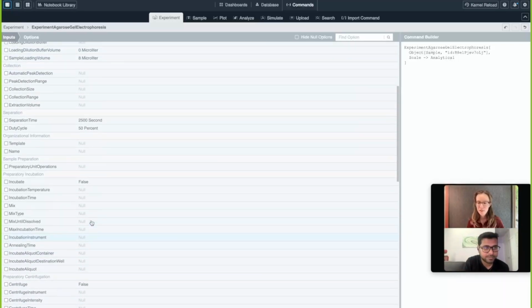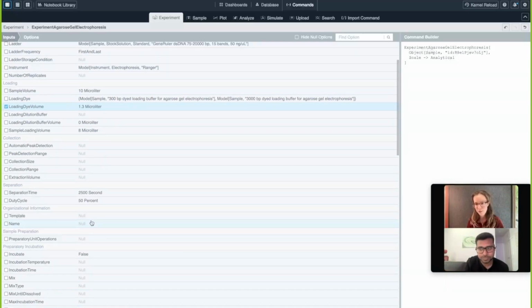And if you leave measure volume as true, which is default, and it does one of these ultrasonic pings and it gets a bad number, that number does update the volume in, and then that can cause problems if it's wrong, because then you'll get weird errors being thrown that you don't have enough sample, even though actually what was wrong was that the ultrasonic's ping was just incorrect in its reading. Right. And you do have enough sample. Exactly. Yeah.